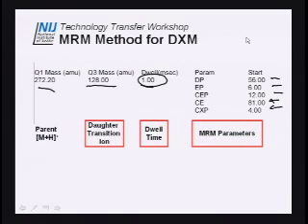Any questions about that? Basically, in the method editor, what you do is you type all those numbers in. What you really do is you have somebody read them out to you, and you just type them in. Or use the Excel clip-ins feature that it has in there now, which is really nice but wasn't there originally. Alrighty.